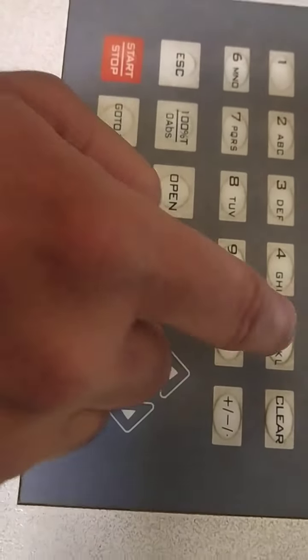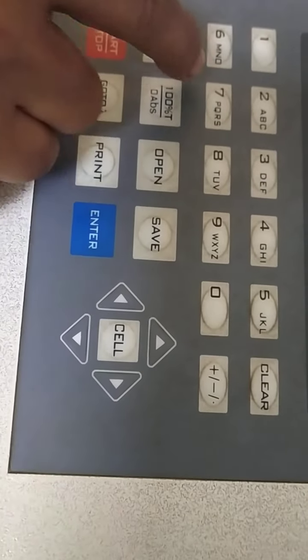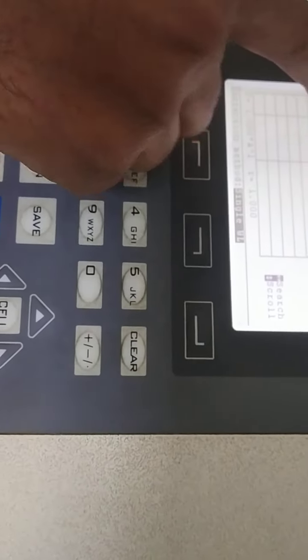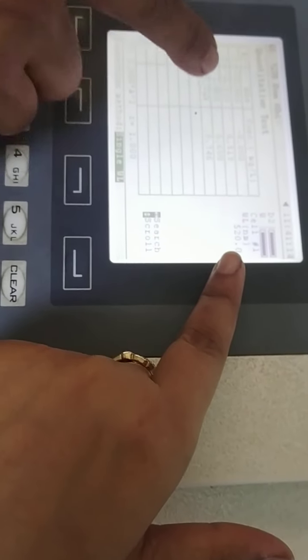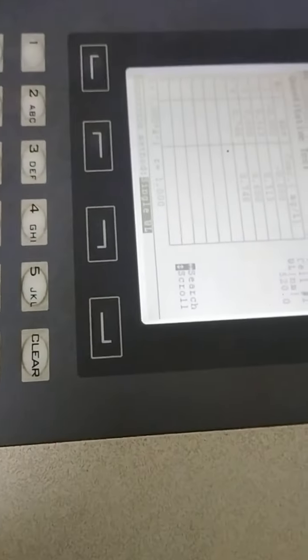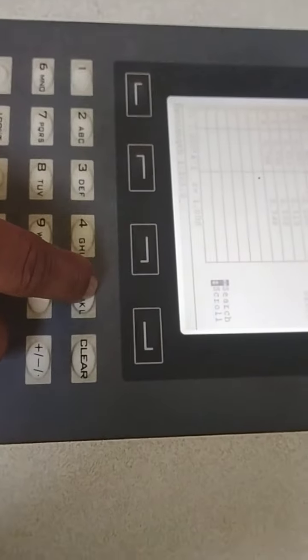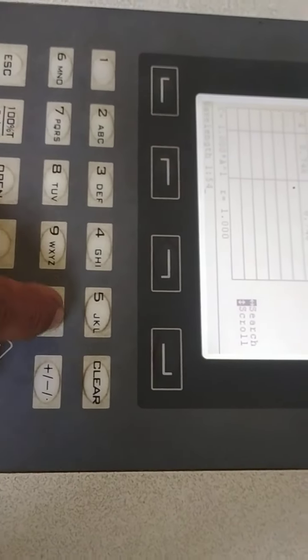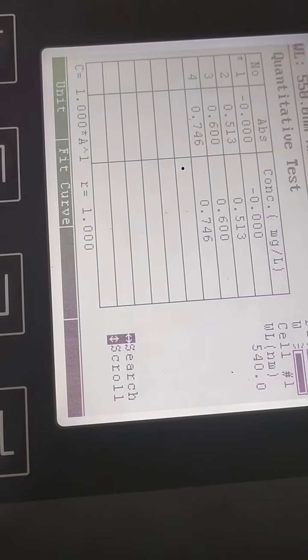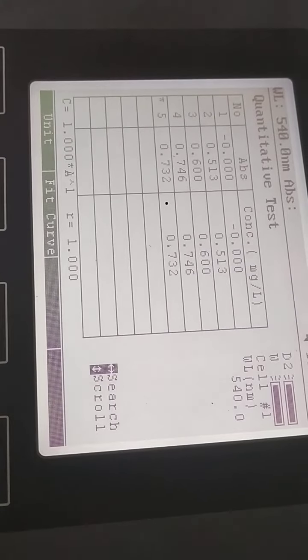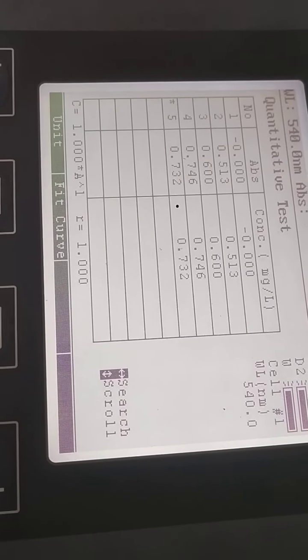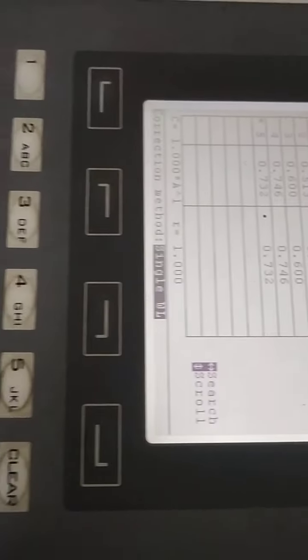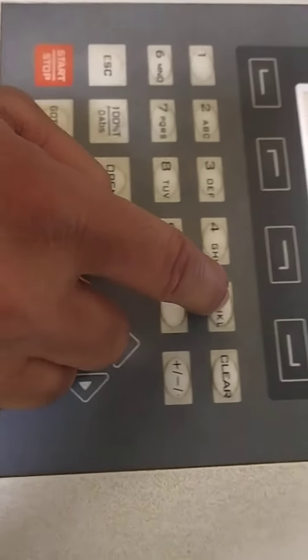Now further we want to change our wavelength to 540. Now further we want to change our wavelength to 550.